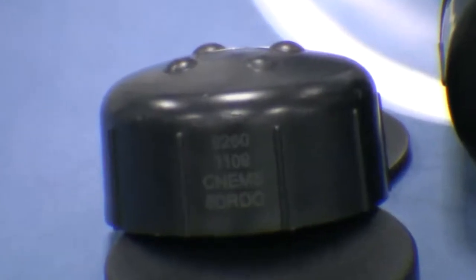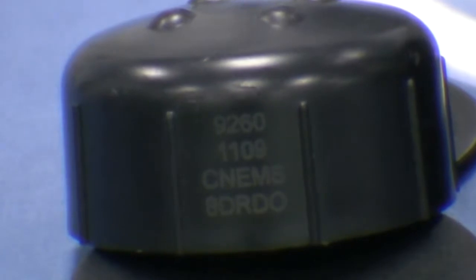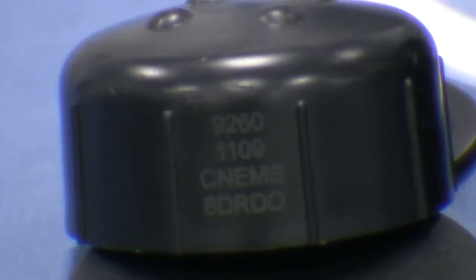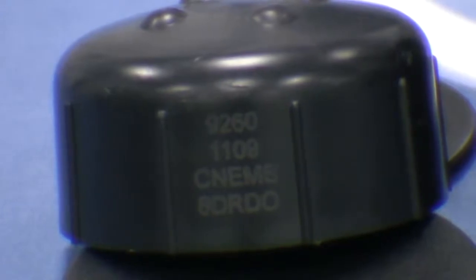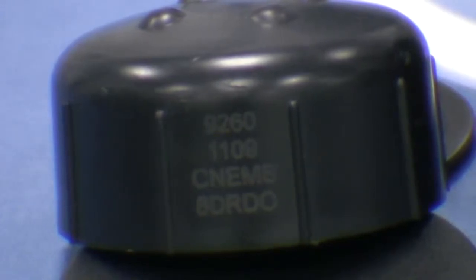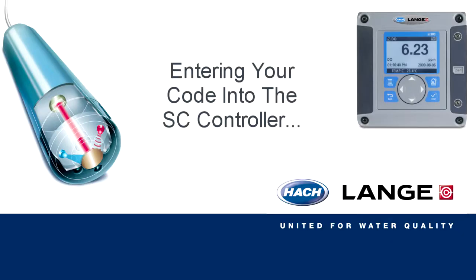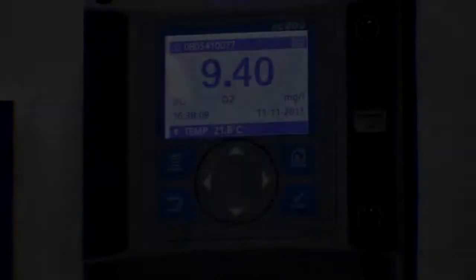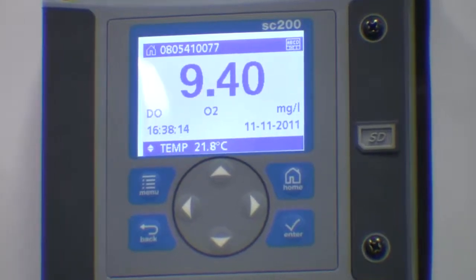On your new sensor cap you will find a sensor code. You will need to enter this code into your SC controller. This enables the factory calibration of your cap to be uploaded into the controller and your LDO probe to operate correctly. You enter the code via the menu in your SC controller.